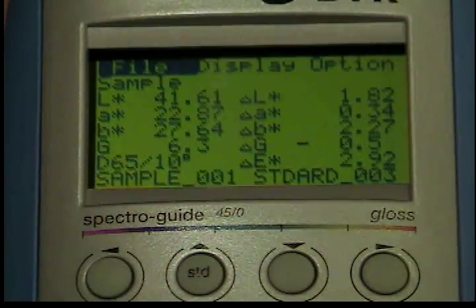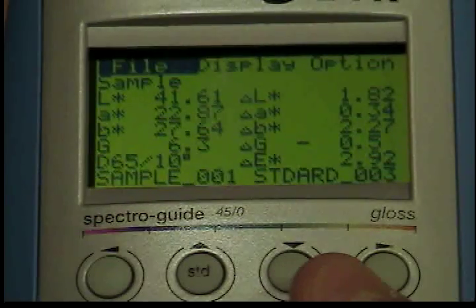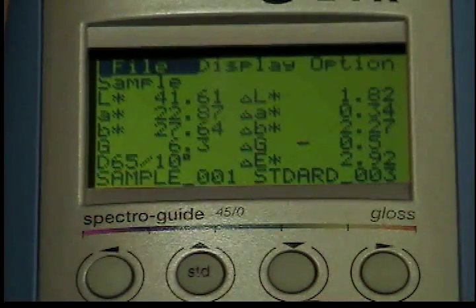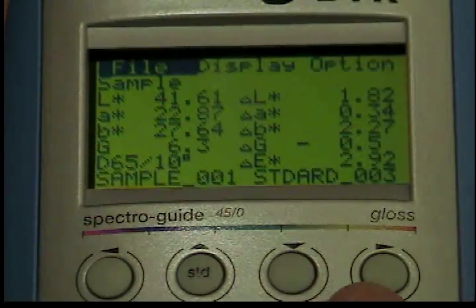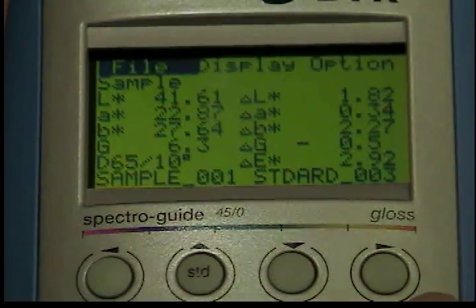The instrument will return to the previous measurement mode. The selected sample will be displayed at the lower left. Standards are opened in the same manner.